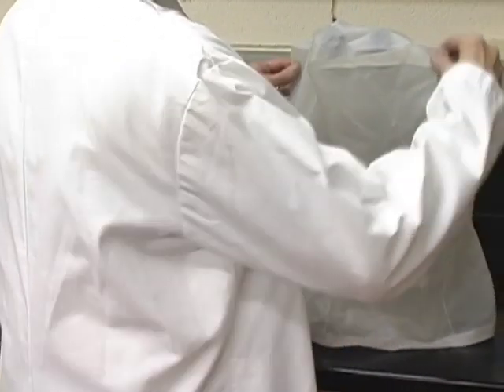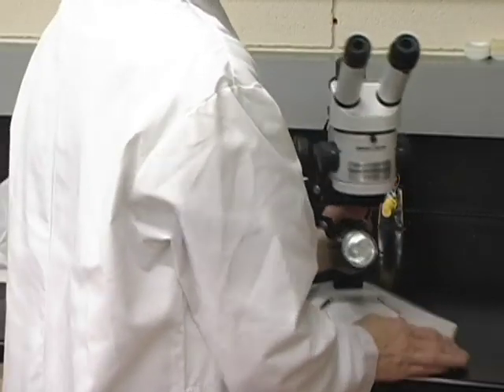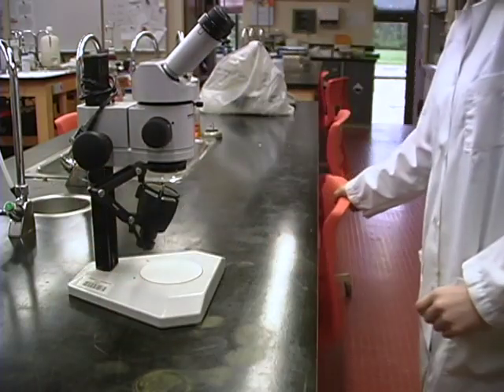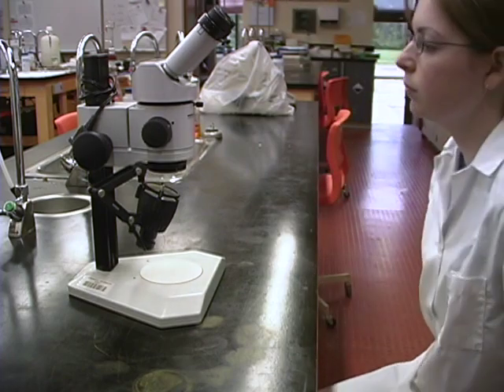First, remove the microscope from its storage location. When not in use, any microscope should be protected from dust, usually with a plastic dust cover. Always carry a microscope with two hands — one hand should support the base and one hand should steady it by its vertical arm or column. A microscope is heavy and needs a solid table to support its weight.